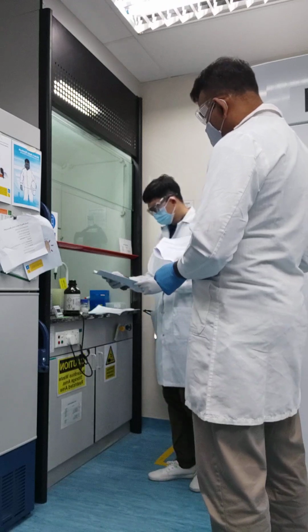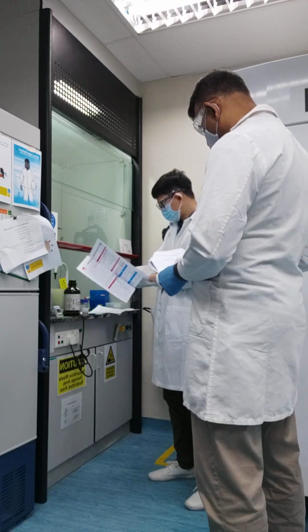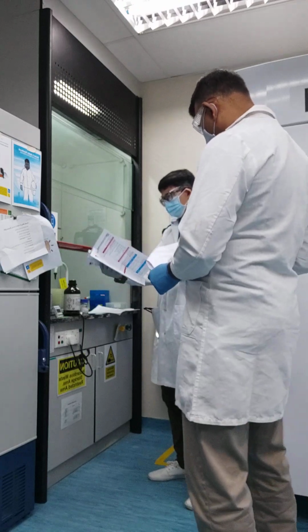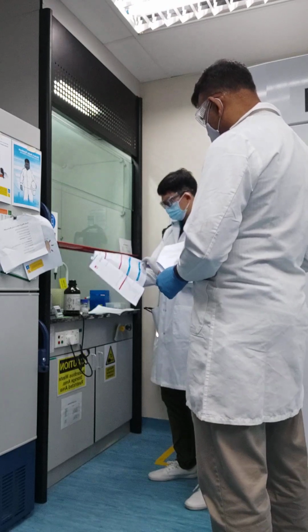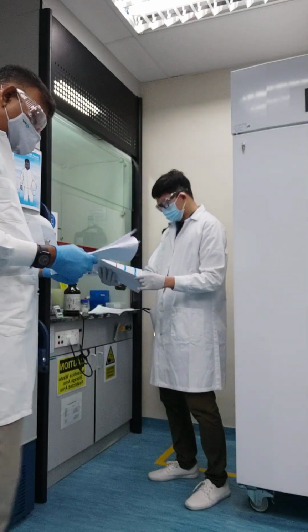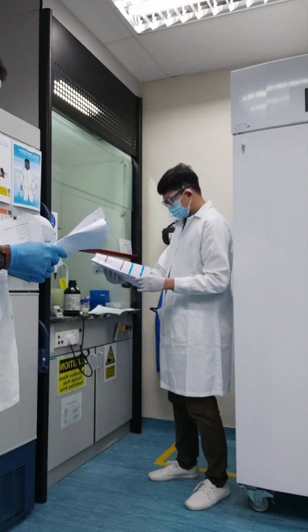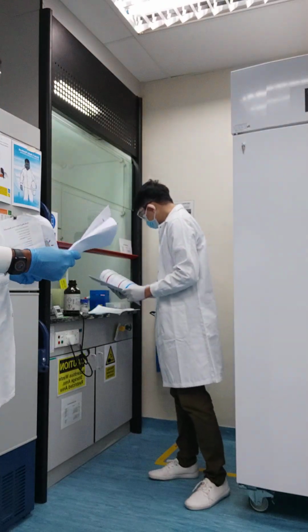Section 1 talks about the chemical. Section 2 talks about the hazard. Section 4 talks about first aid. Firefighting and accidental release follow, and Section 8 talks about PPE. So this is the PPE I need to wear. Okay, I'm ready. I know what information I need.